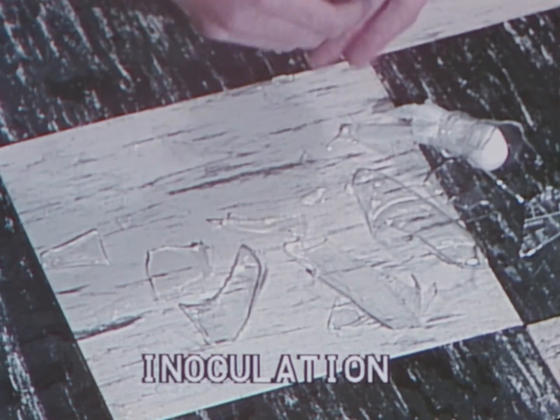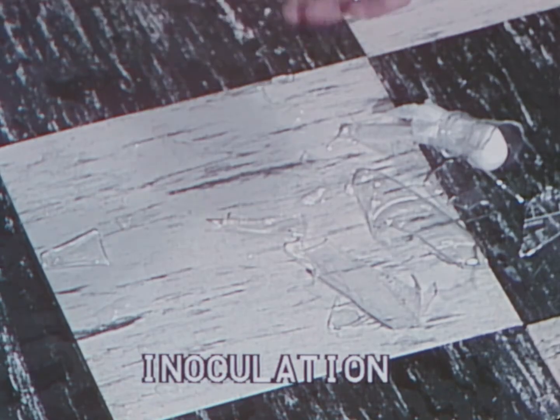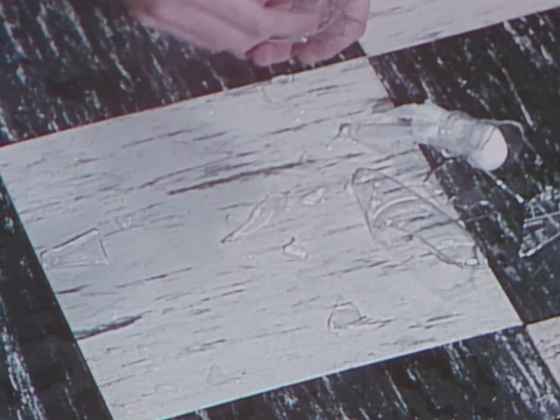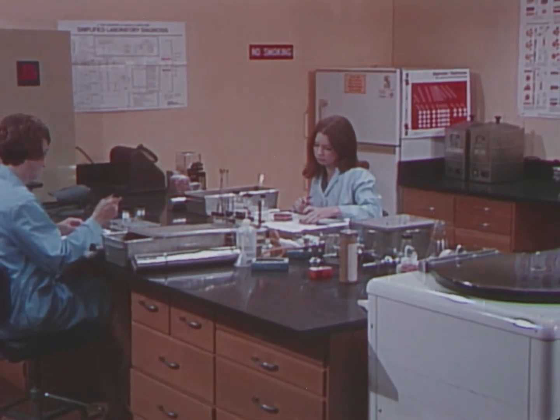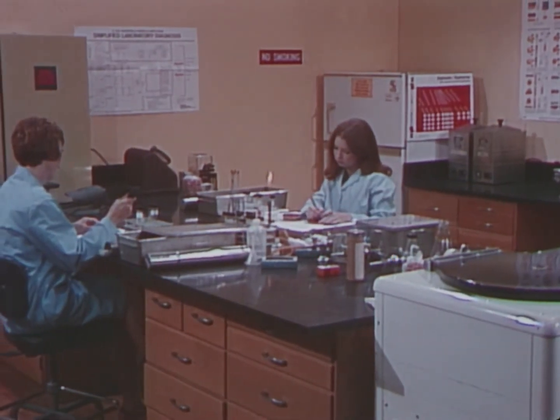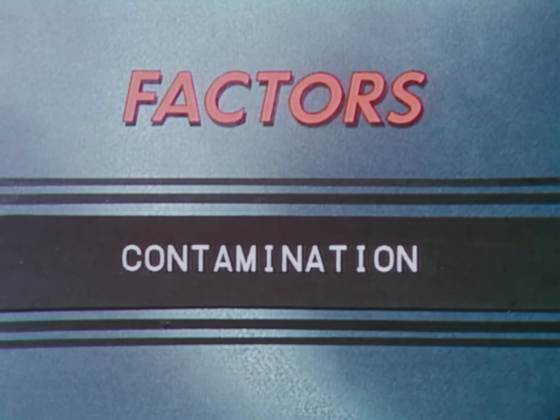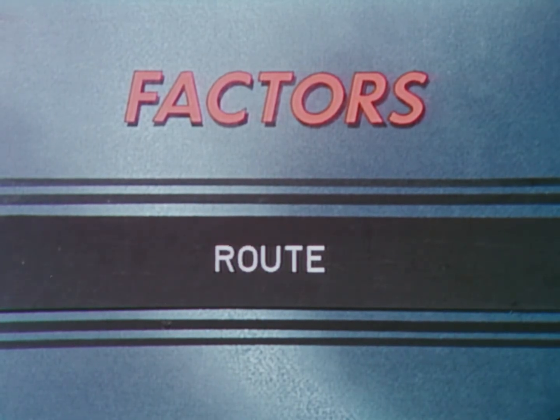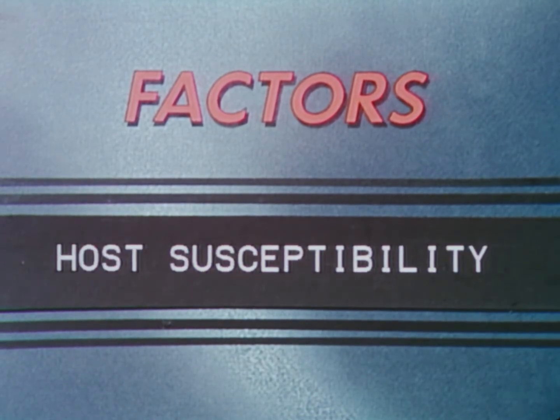Still another route of infection is through accidental inoculation, which may occur as a result of animal bites, needle inoculations, or punctures by broken, contaminated glassware. We have explored 2 of the 4 factors determining infection: extent of contamination and route of infection. The other 2 factors are virulence of the organism and host susceptibility.